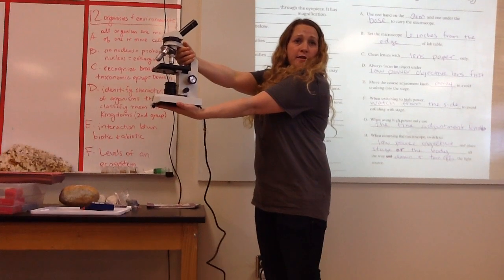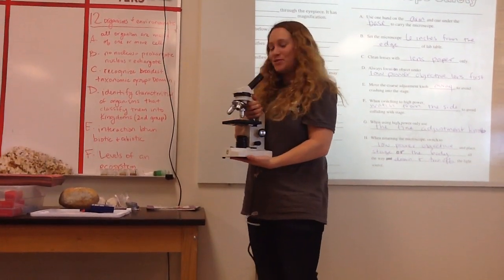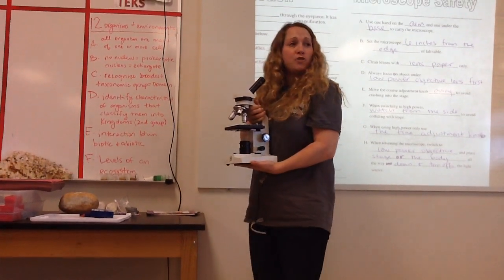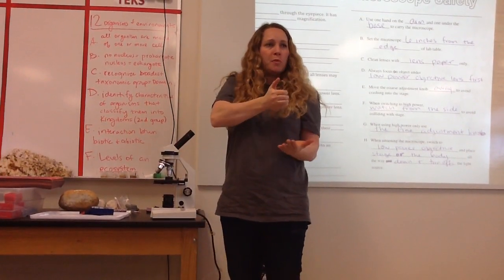You're not serving drinks at a restaurant. You're holding a microscope and keeping it safe. So, hold it this way. Can I see you please try that? Everyone, base, arm, close to body.